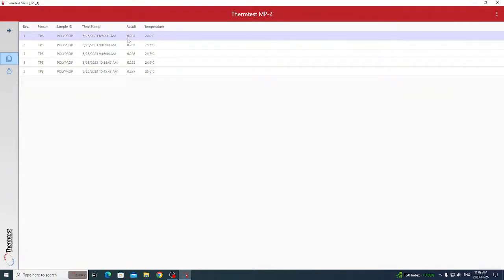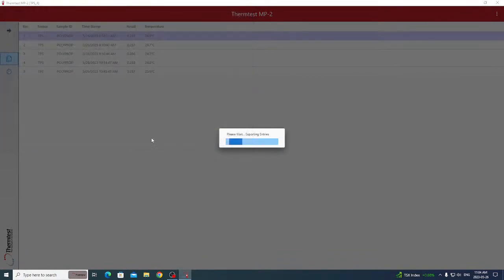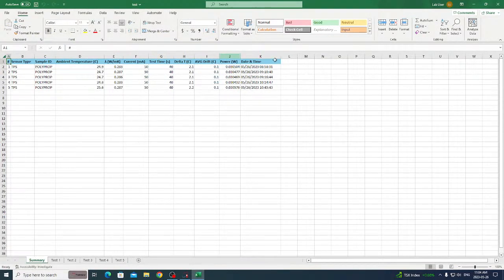To export results to Excel, right-click on a measurement. You can choose to save the selection — just the single measurement or however many you've selected — or save all, which saves all measurements done on the MP2 device. Select save all, choose a save location, and it will open in Excel, showing the temperature, thermal conductivity, current, and test time for each measurement.